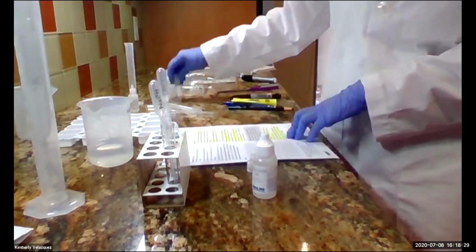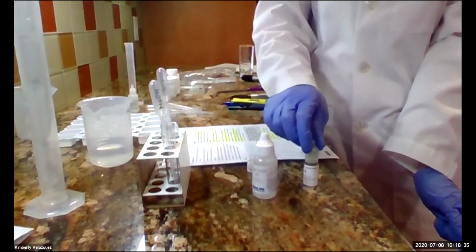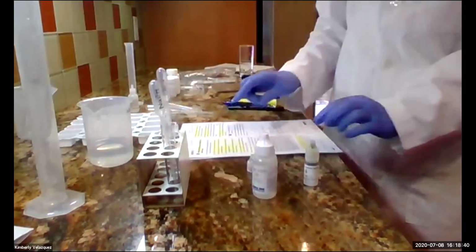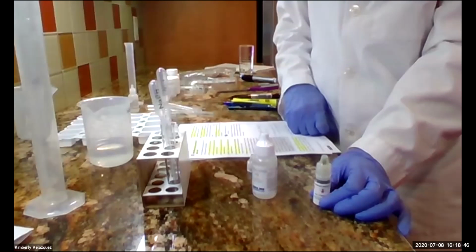Okay, so the pH indicator is this dark solution. It's called Bogen's pH indicator. There are a lot of different pH indicators that are used in science. This one happens to be the Bogen's. What's important to note about this pH indicator is it really only reads pH 4 to 10.